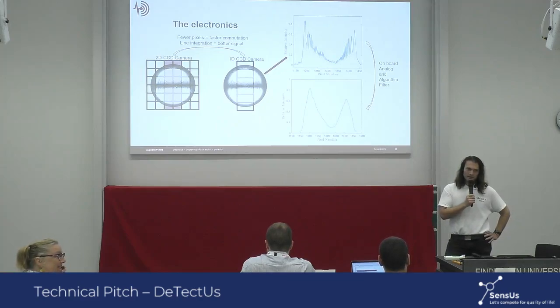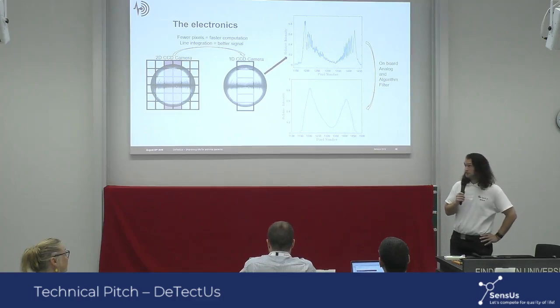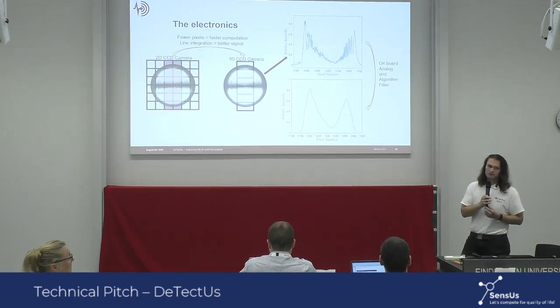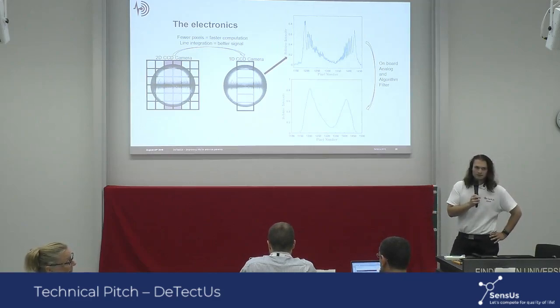We haven't tested that yet, so I don't know. But in general, with the surface plasmon resonance, is there a change in signal depending on the size of the molecule that you bind? Yes, so the plasmon wave evanescently goes out into the medium. It's strongest at first, and it gets most affected by the size; the bigger the size of the molecule, because they will give a larger increase in the refractive index on top of the media. So in theory, you might find a different signal if something like that would happen. Okay, thank you.